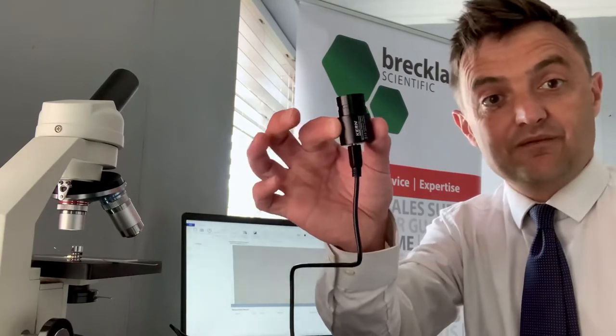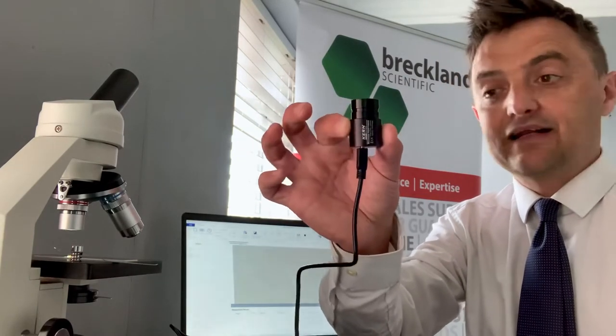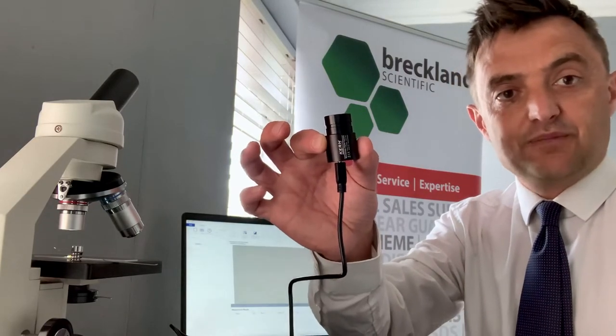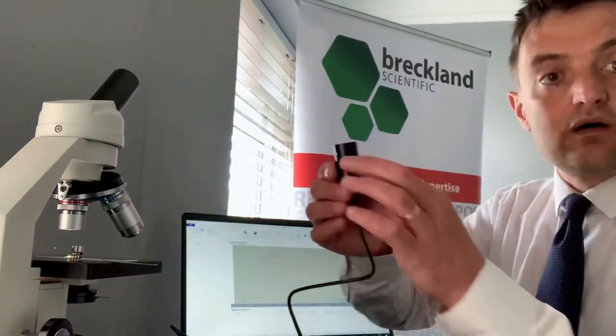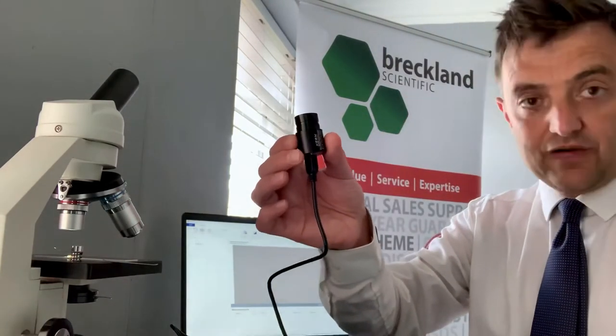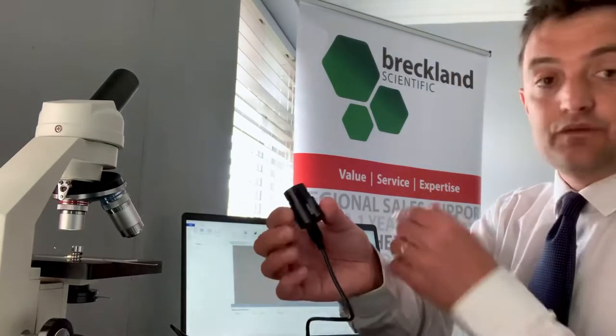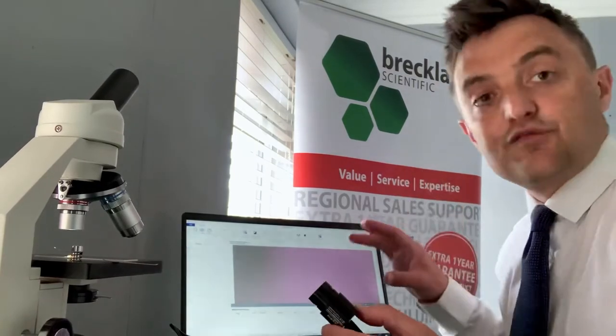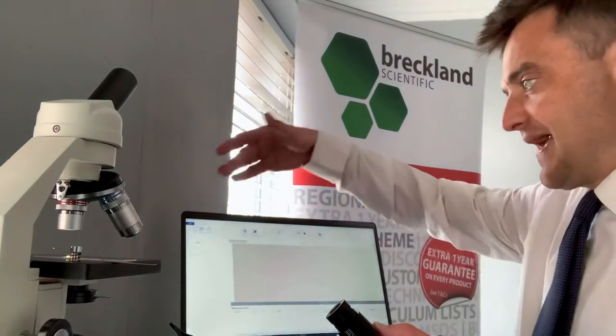That's it in my hand there - that tiny little camera. It comes in 1.3, 3, or 5 megapixel versions. We simply connect it to our laptop or computer via the USB cable. It's almost plug and play really - we download the software, very easy to do from their website. The software itself is really intuitive, so everything you need is there.